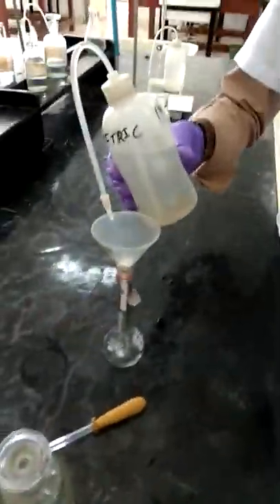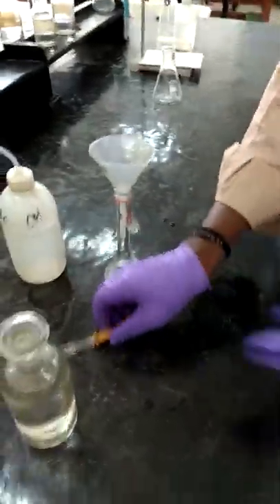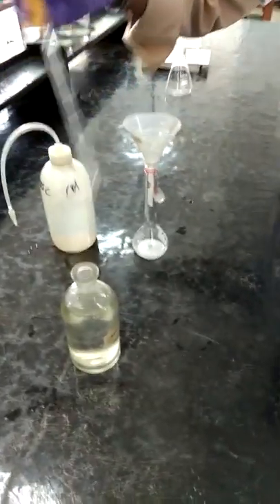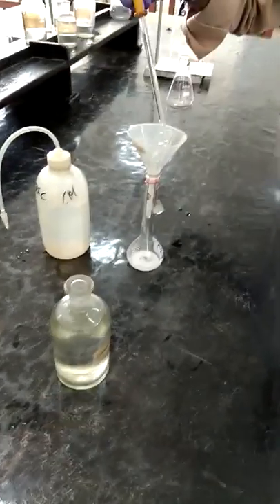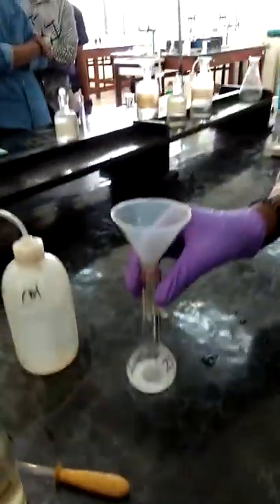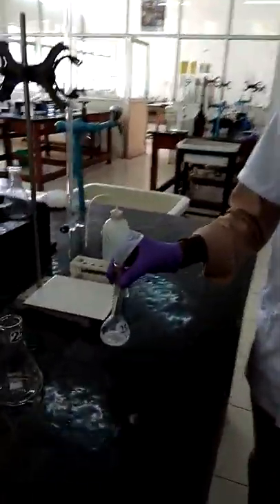For this, you first transfer the salt by adding distilled water. You add a little water, just to transfer the salt. Then EDTA is not easily soluble in water, so you need to add one or two test tubes of ammonia, just to increase the solubility. Then you add half a bottle of water. Don't add full. Then wash all the salts.